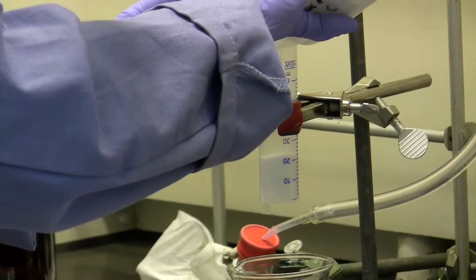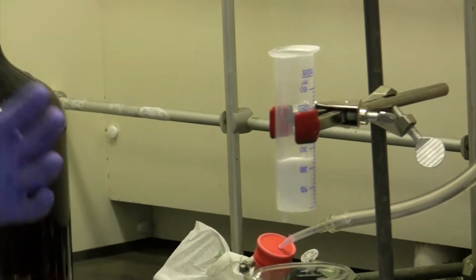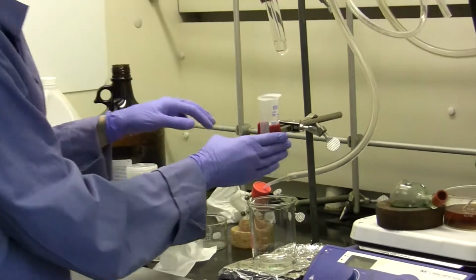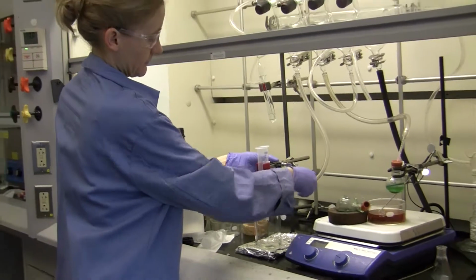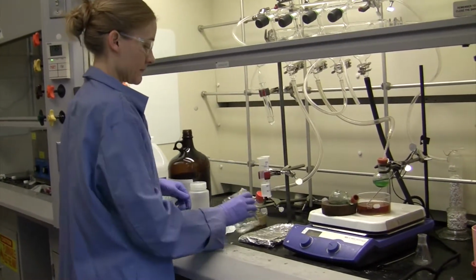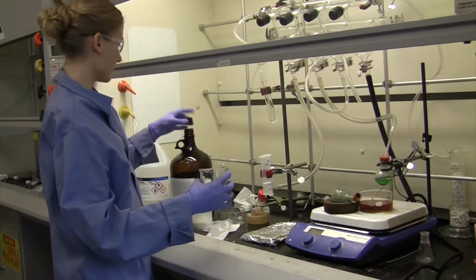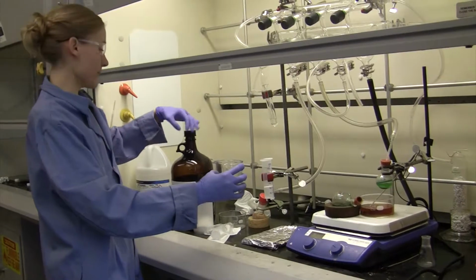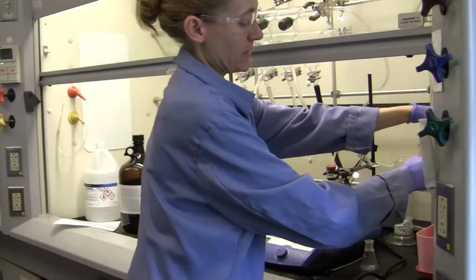So basically what's happening here, what we're doing in this step, is removing the catalyst, the copper catalyst. A little bit of extra chloroform here. Make sure you're capping your chloroform when it's not in use. We're going to put this over in our chlorinated waste.